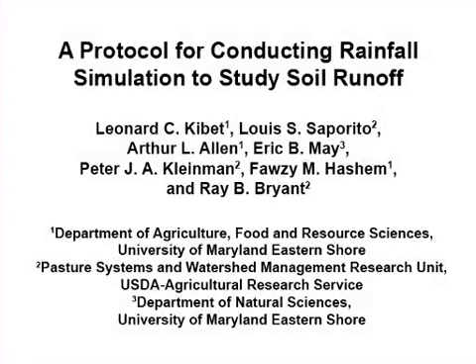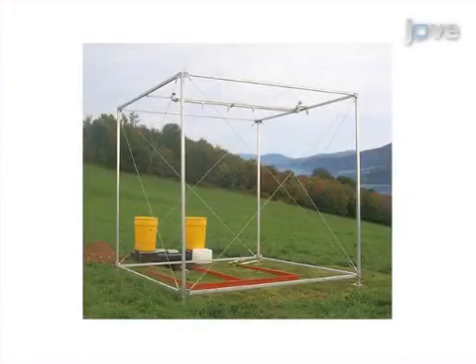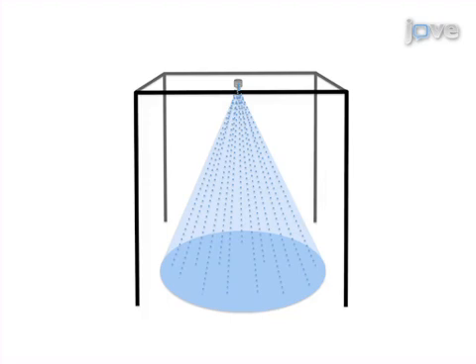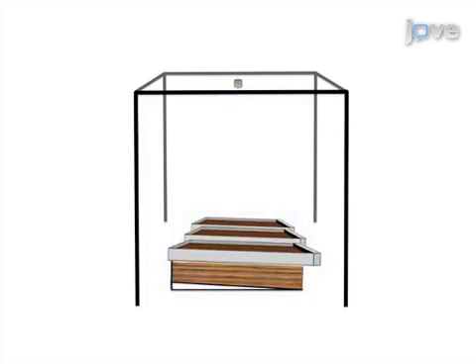The overall goal of this procedure is to simulate rainfall having a standard drop size, intensity, and uniformity across the target area to study soil runoff. This is accomplished by first adjusting rainfall simulator controls to achieve the approximate pressure and flow rate for the selected nozzle. The second step is to calibrate the rainfall simulator to achieve the exact flow rate for the selected nozzle and a uniform distribution of raindrops across the target area.